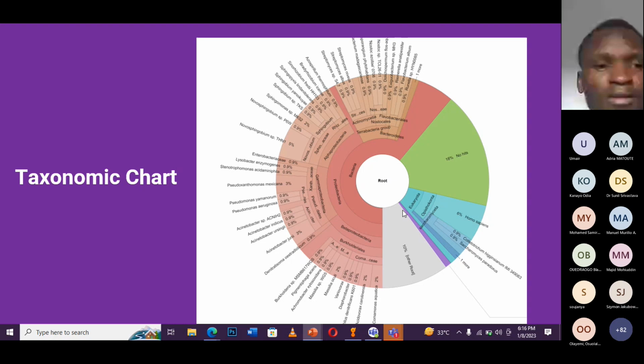You can actually do taxonomic classification in whole genome, but when you do that, you only have one name, the name of the sequence, just one. You will not have it this way in metagenomics because, like I said from the beginning, metagenomics deals with the entire community of microorganisms present in a sample. So you have the names of the different organisms present in your metagenomic sample.